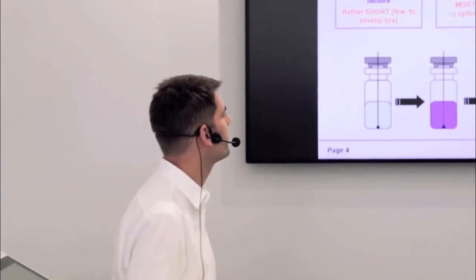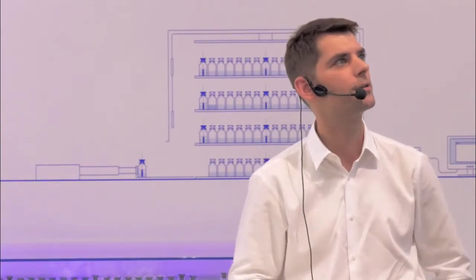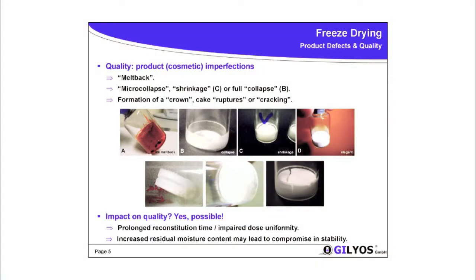about. This is our key topic for today, product temperature measurement, and how we can achieve that product temperature measurement, or can technically realize product temperature measurement. So this slide quickly illustrates product defects, which again ultimately lead to some compromises in product quality.